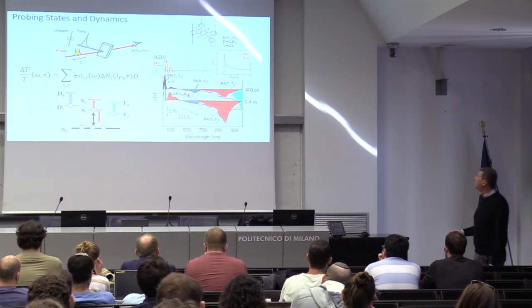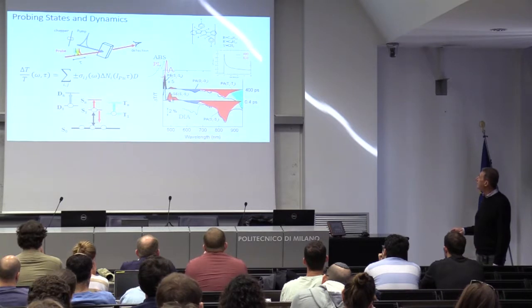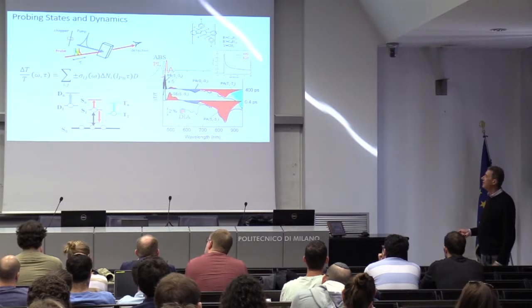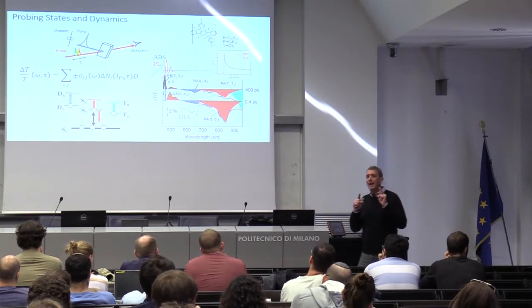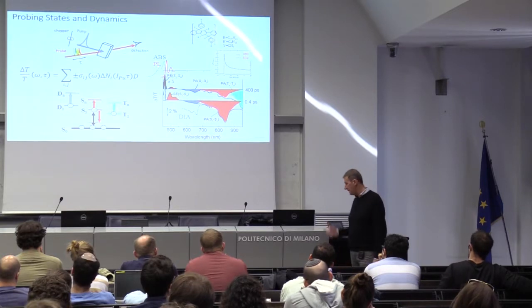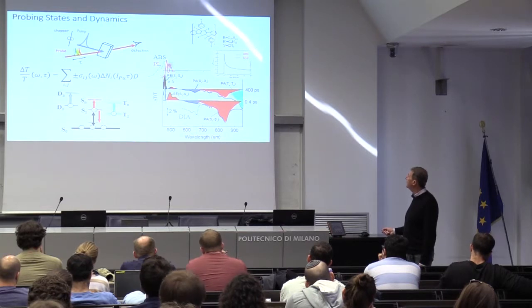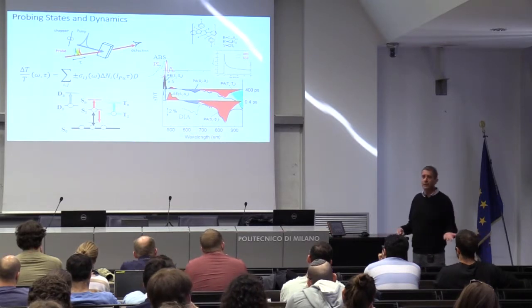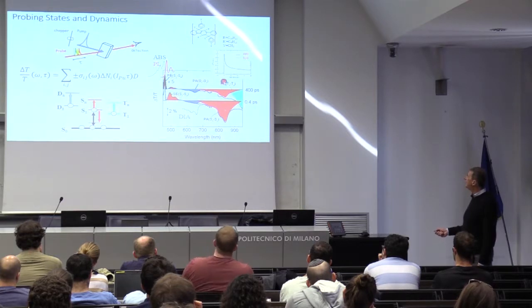other states. Then you see two in red, two features. This is a positive peak and this is a negative peak. And now this is in wavelength, so this looks much broader than this. Actually, they are comparable because it's wavelength, not energy. Now, these two are stimulated emission and photoinduced absorption from the singlet state. How do I know? Number one, this spectrum here overlaps with photoluminescence, and stimulated emission should look like photoluminescence. Number two, this state here and these two spectral features have the same lifetime.